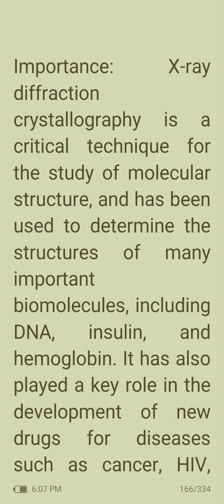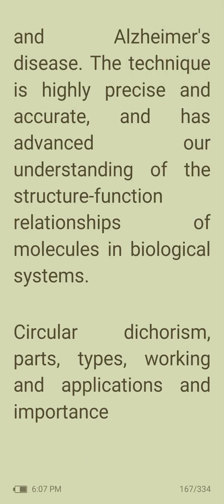It is a critical technique for the study of molecular structure and has been used to determine the structure of many important biomolecules, including DNA, insulin, and hemoglobin. It has also played a key role in the development of new drugs for diseases such as cancer, HIV, and Alzheimer's disease. The technique is highly precise and accurate and has advanced our understanding of the structure-function relationships of molecules in biological systems.